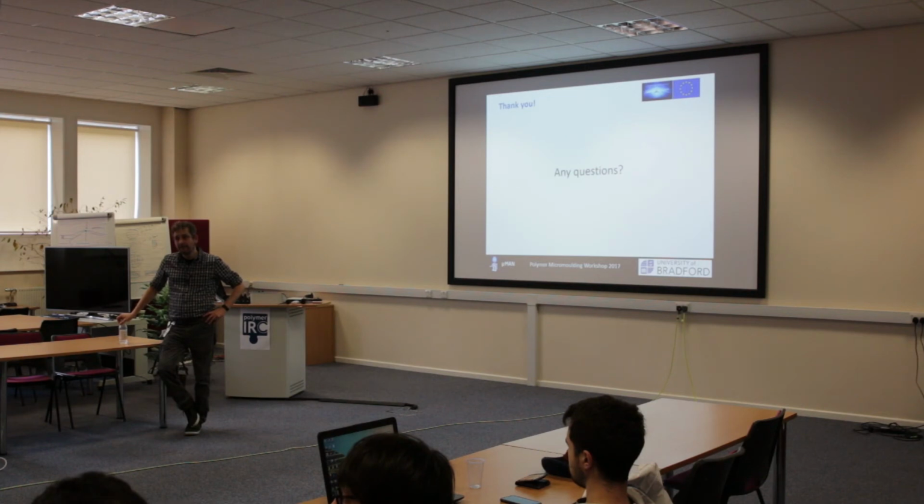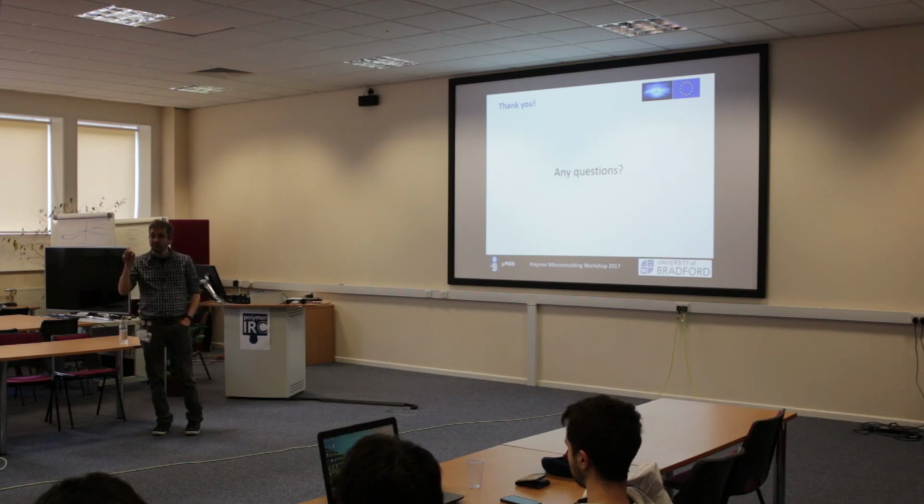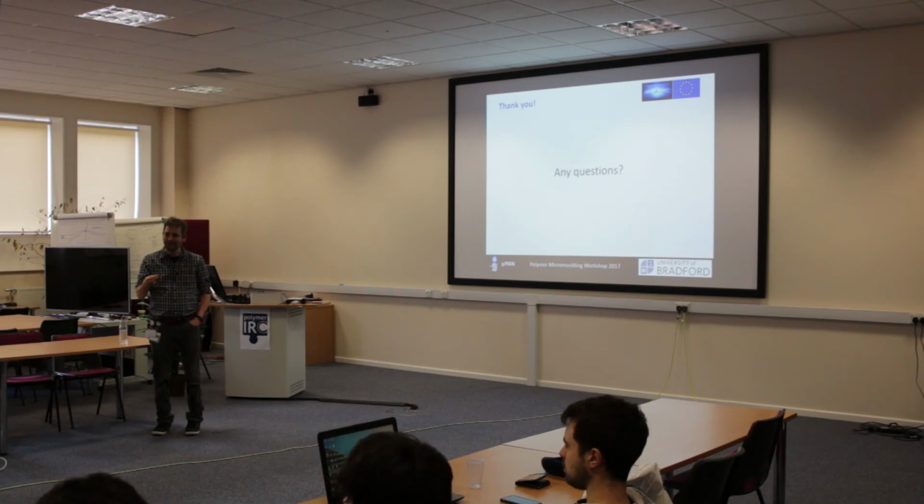Okay, so that's the thing. This is a point source, so you're not flooding it as you do with X-ray at the dentist or whatever. You don't just hit everything with X-rays. This is a point source, so you're collimating your optics and focusing your optics to be as small as possible. In this case, you're looking at around a micron. You won't get much lower than that, but the detail you get back by focusing at a micron is at a lot better resolution than the micron.